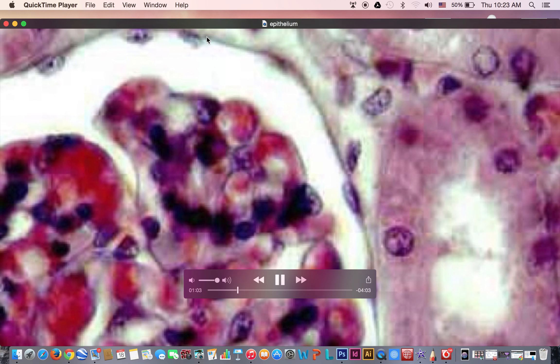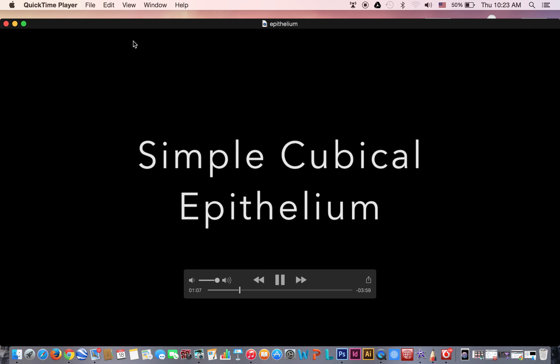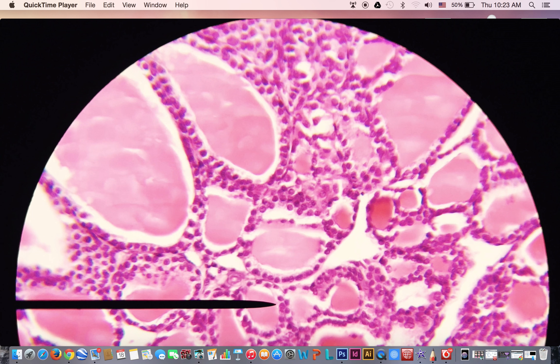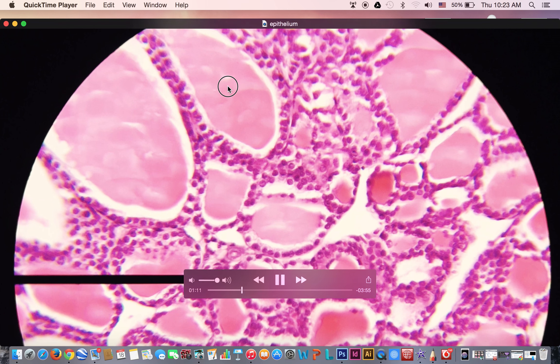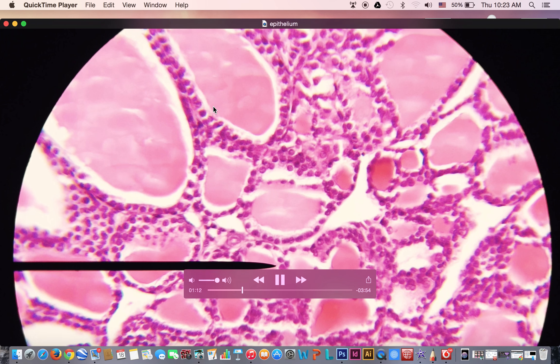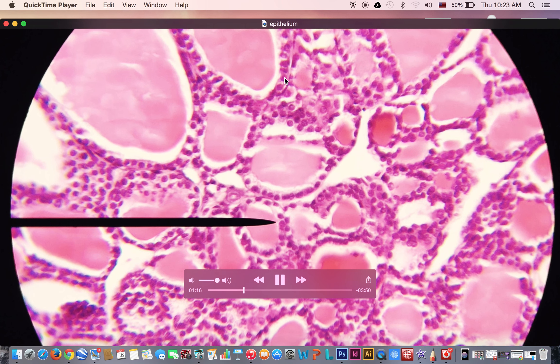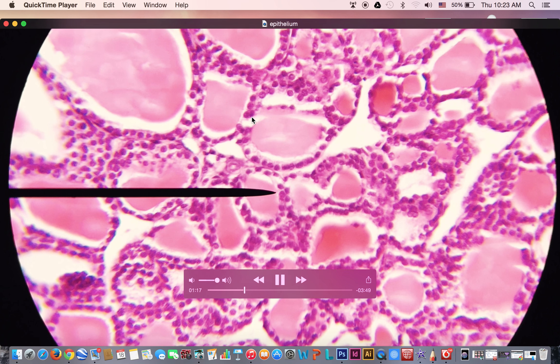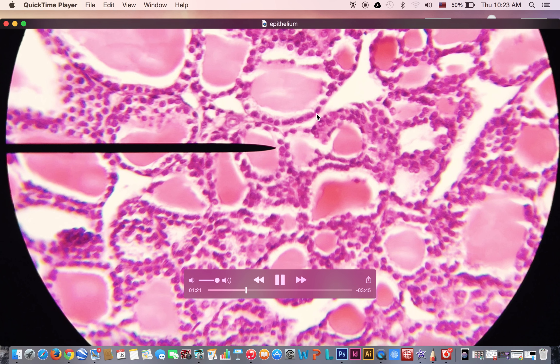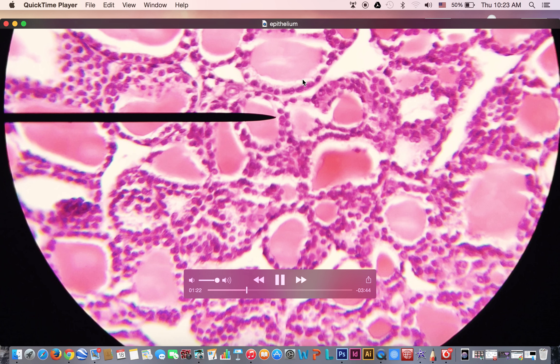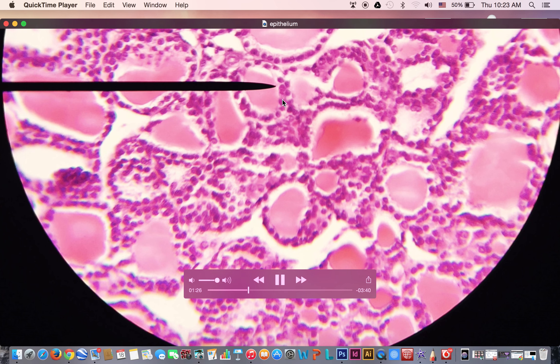The second type is the simple cubical epithelium. This slide shows the thyroid follicles filled with colloid, pink in color. The lining epithelium is formed of one layer of cells that have rounded central nuclei, which is characteristic of the cubical epithelium. So this is a simple cubical epithelium.